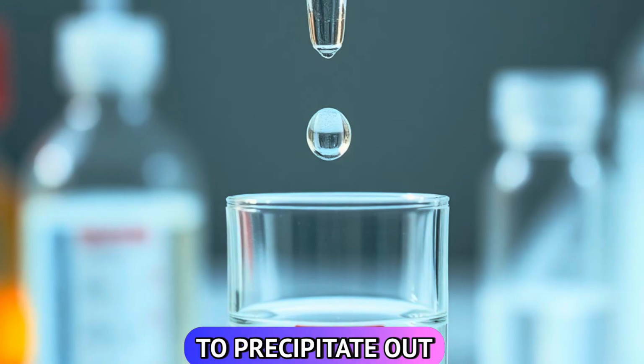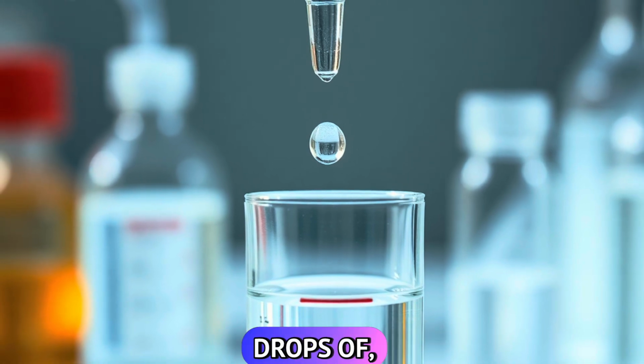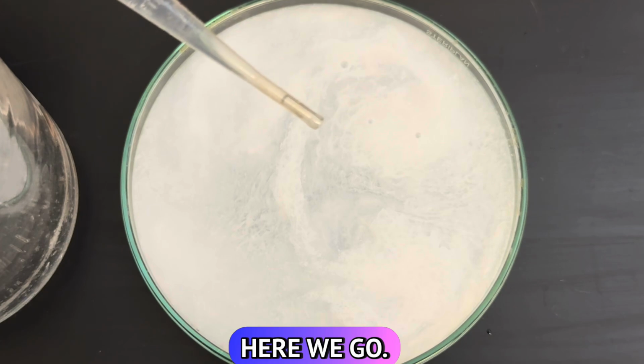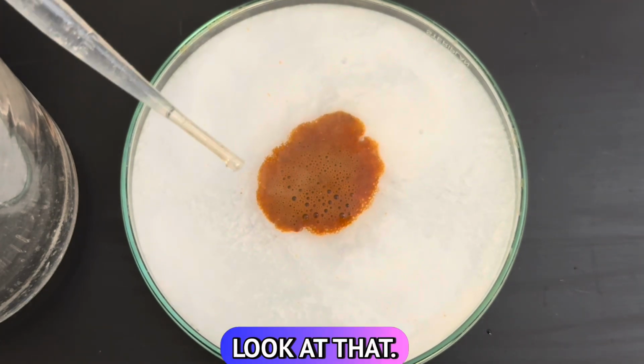And again, to precipitate out that lead oxide, we're going to use drops of hydrogen peroxide. Here we go. Look at that.